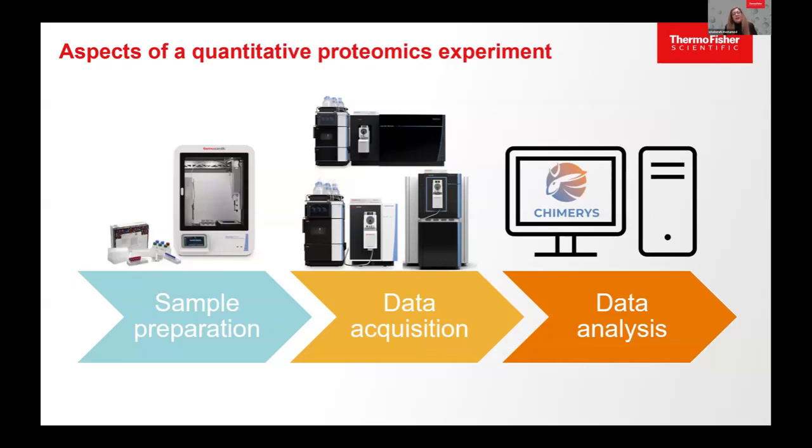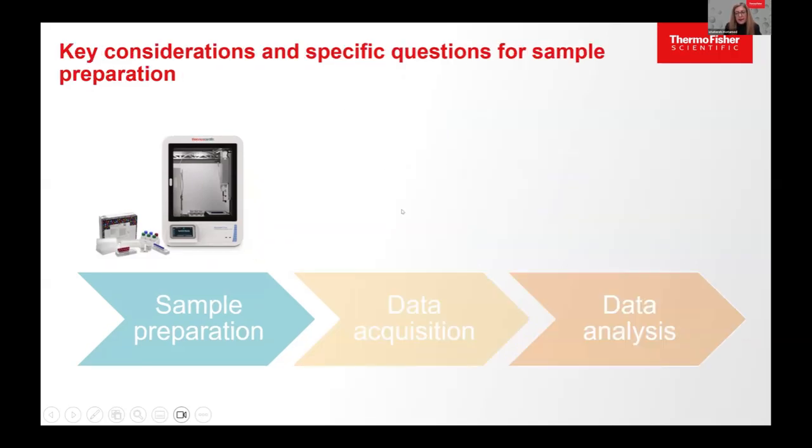And when it comes to the workflow, DIA or DDA, in this case DIA, there is a whole workflow that includes the sample prep, LC-MS, and data analysis, right? My colleague will cover the data analysis, but on the sample prep and the data acquisition, just to say, running a proteomics core, when you have up to 10 samples, it is typically done in the manual way, right? Gels, spot, IP, or things like that. When the project is bigger than that, right?